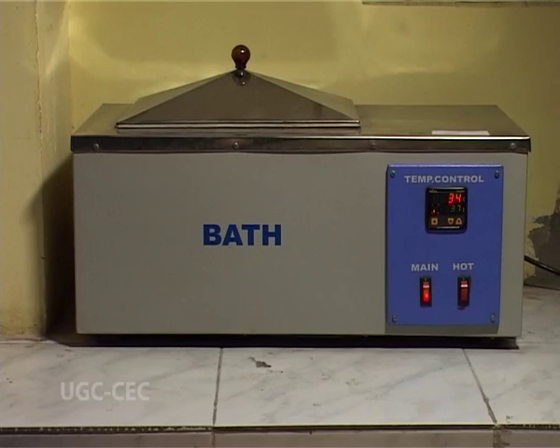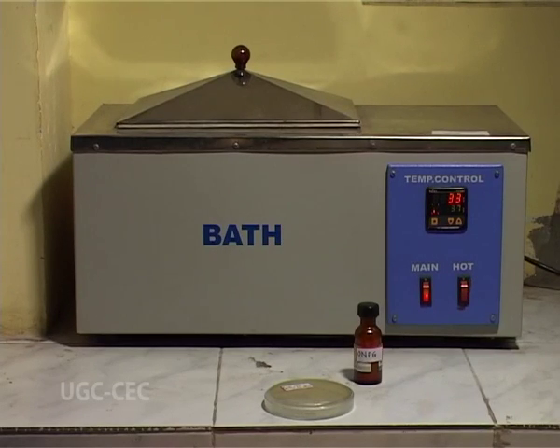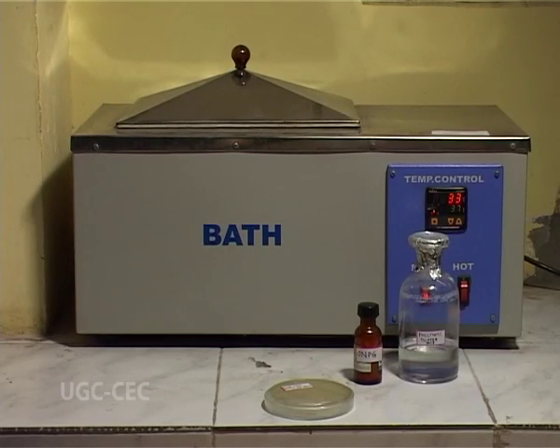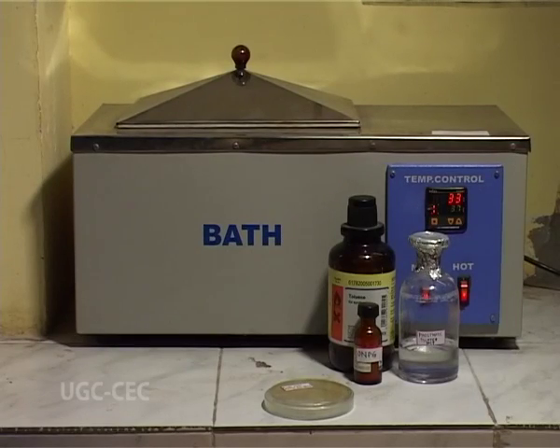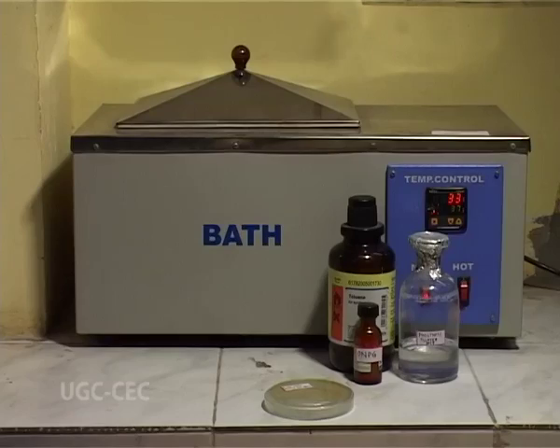The materials needed to execute the experiment are a strain of E. coli B, which has an active Lac operon. Next, we have orthonitrophenyl beta D galactoside. It has to be dissolved in phosphate buffer with pH 7, as this pH is necessary for the activity of the enzyme beta-galactosidase. Next, we need methyl benzene or toluene for the lysis of the cells, or to make the cells permeable so that ONPG gets entry inside the bacterial cells.